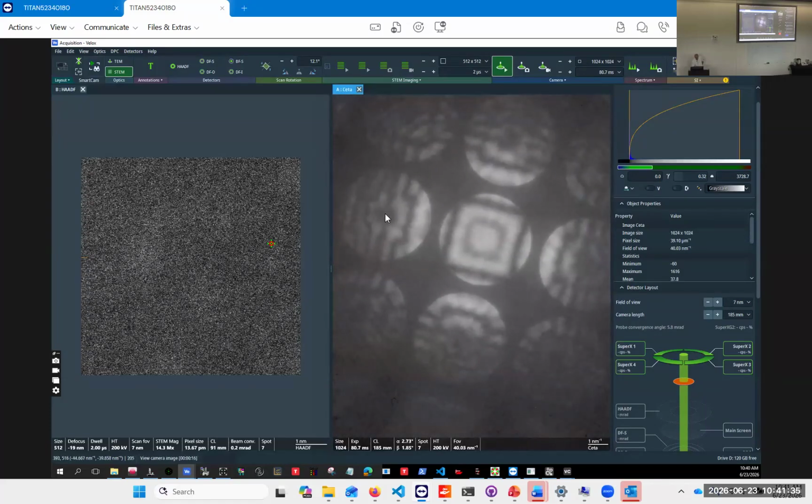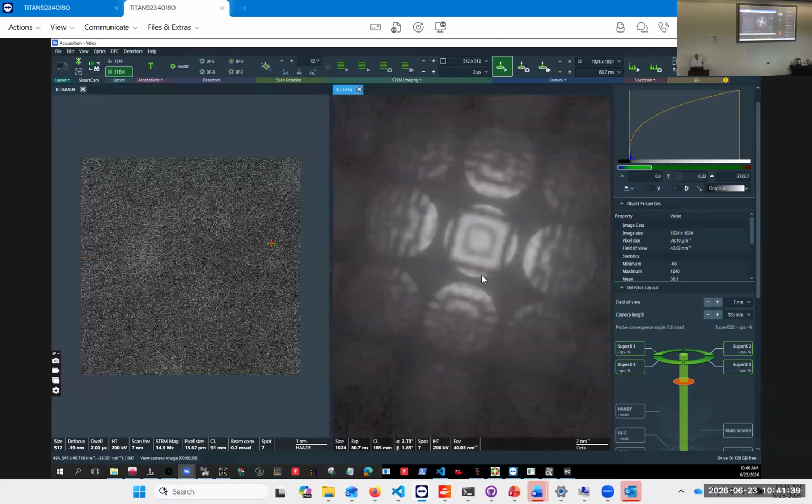If we look at that, we see all the different features here are really in the fourfold symmetry independently. What we want to do next is, remember how many black features we have here, how many squares we have here.